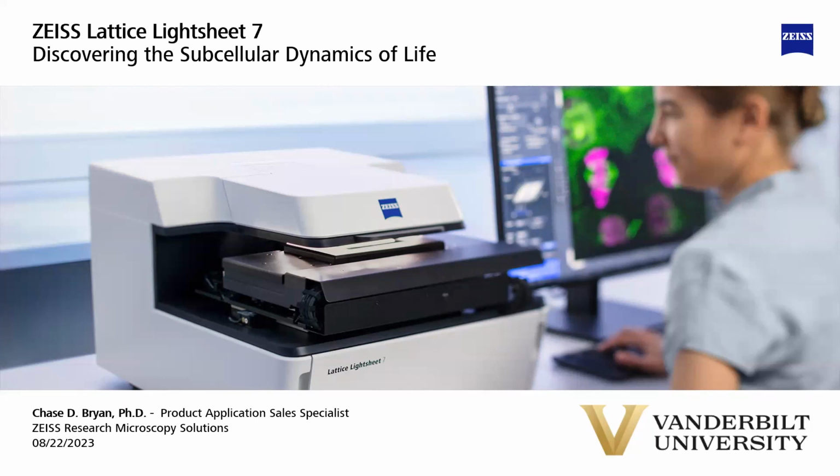Today, I'm going to be talking about the Zeiss lattice light sheet solution. We're really excited to bring this microscope to campus and really see how we can incorporate lattice light sheet technology, or rather Zeiss's interpretation of lattice light sheet technology, into the Vanderbilt workflows, and see what you guys can do with that and the instrumentation that we have to offer, and see how we can apply that for your high impact research that you're doing here at Vandy.